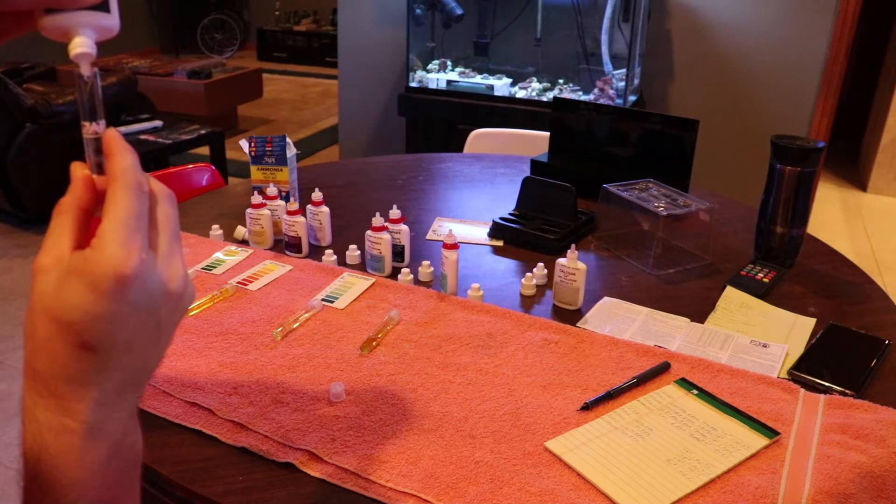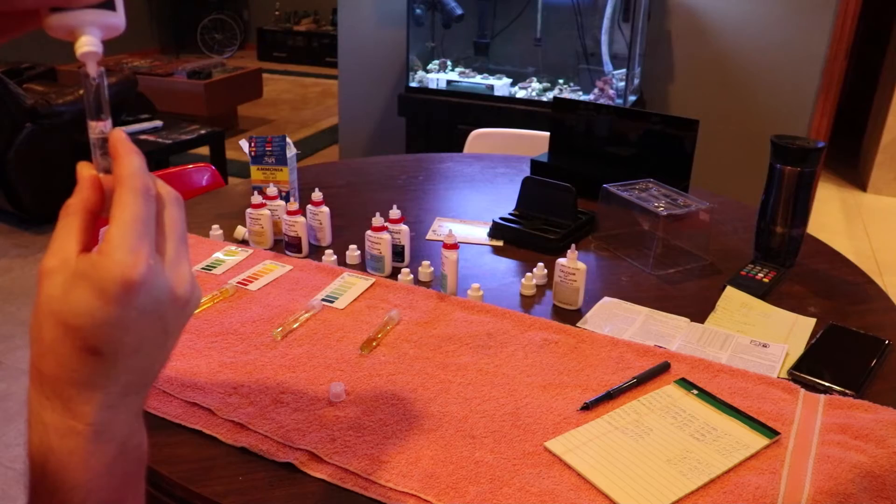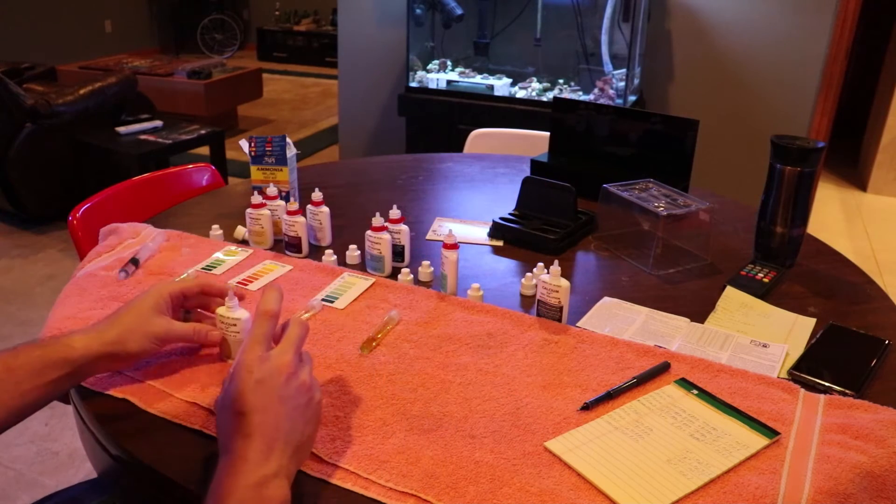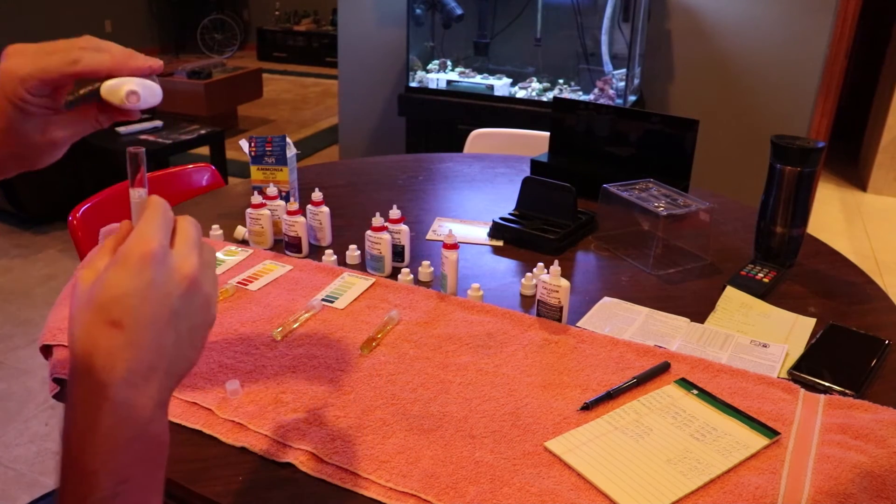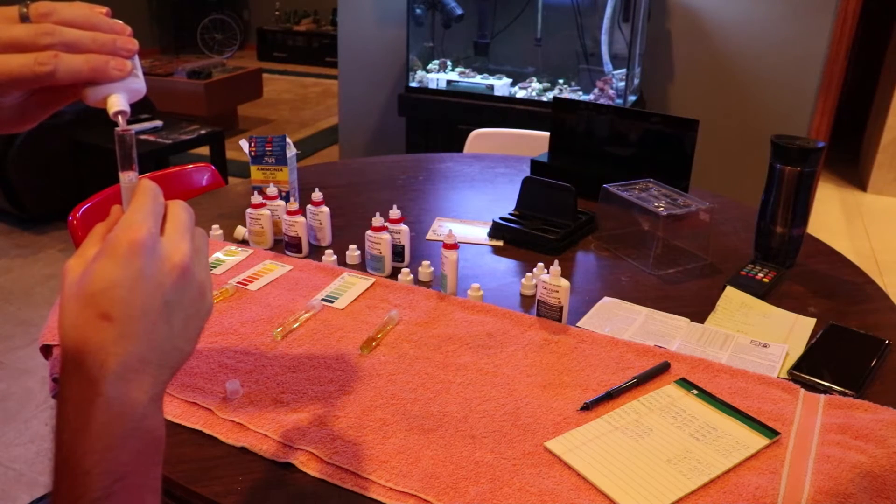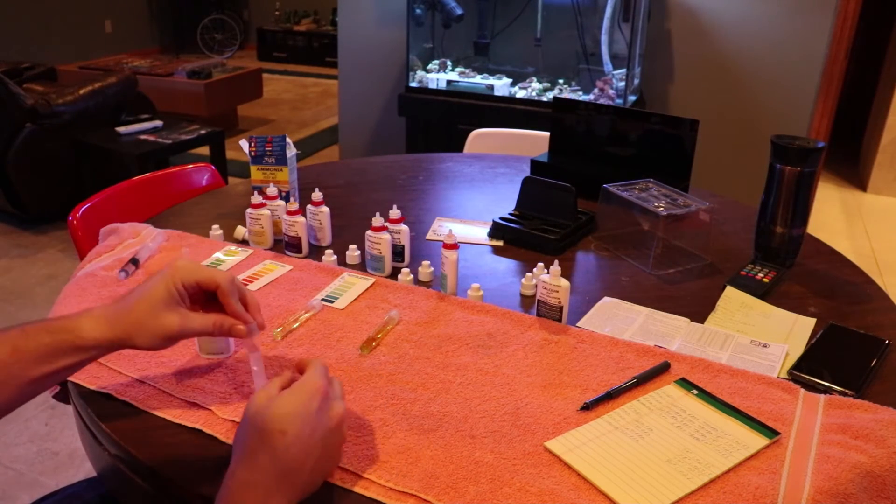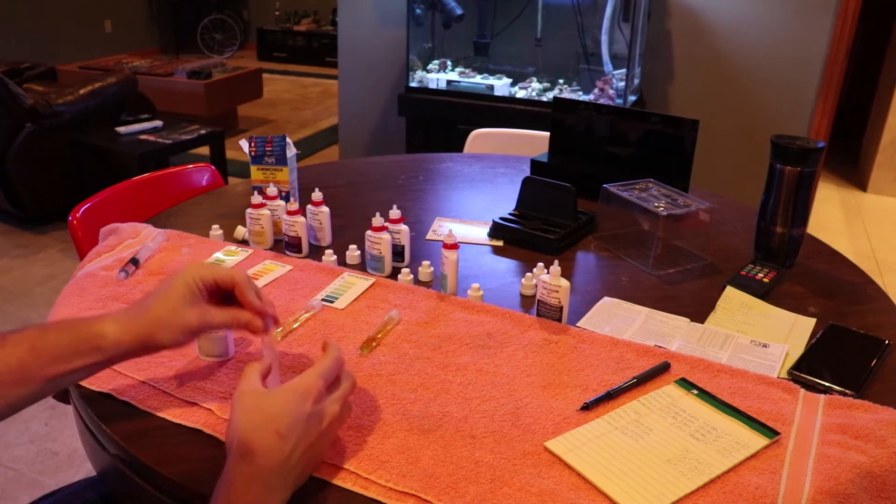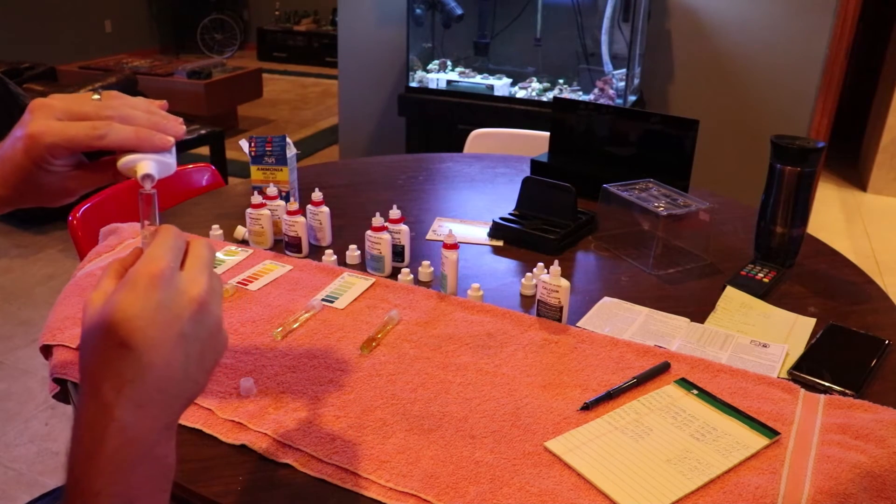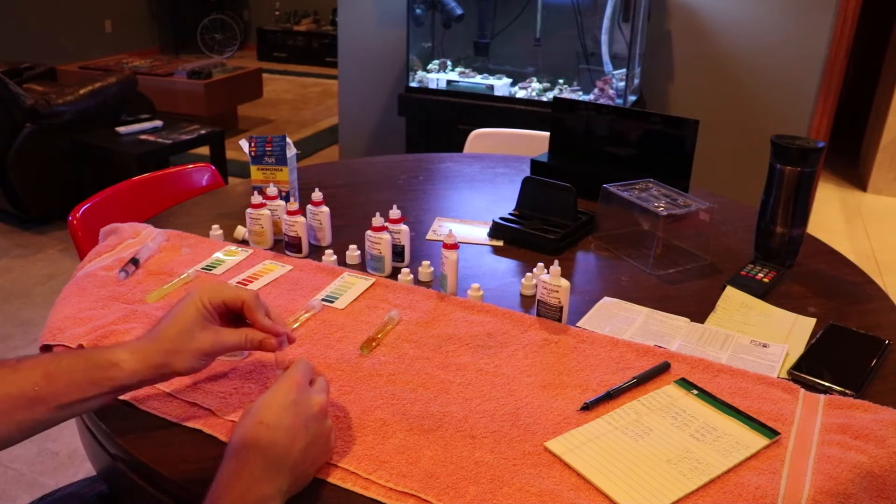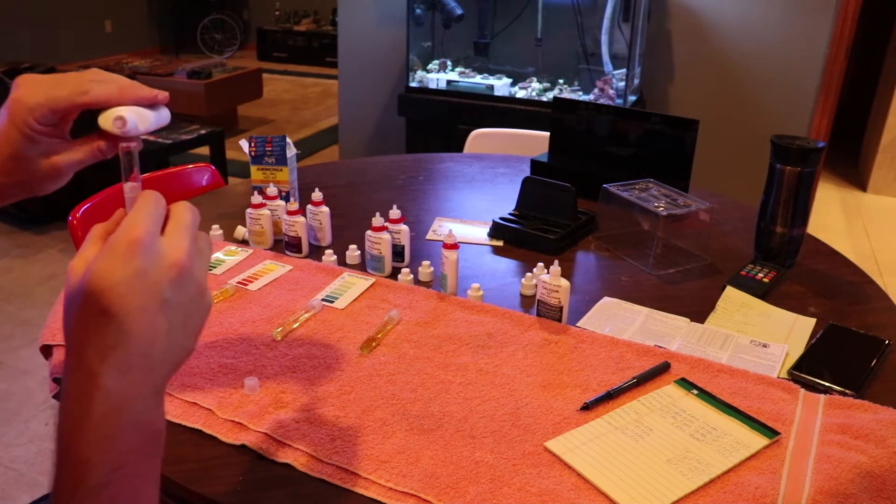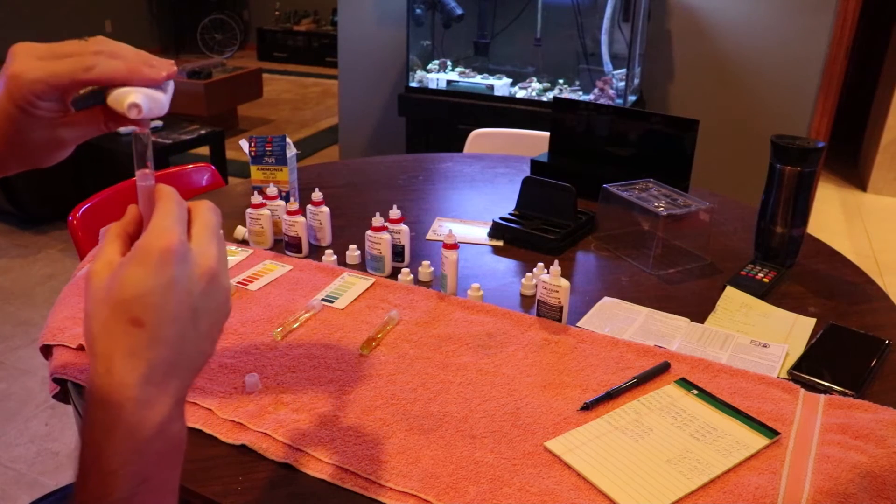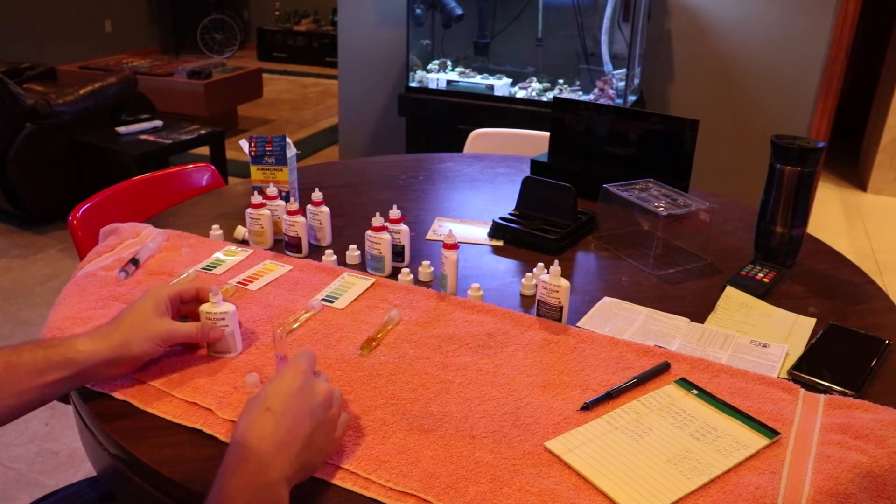Moving on to calcium. Calcium bottle number one, you're going to add 10 drops, put the cap back on, shake it. A lot of redundancy here with this testing. Then what you're going to do is add one drop at a time from bottle number two, put the cap back on, shake it. Do it again, another drop, cap back on, shake it. You're going to keep doing this until the liquid in the vial turns from a pink color to a dark purple.